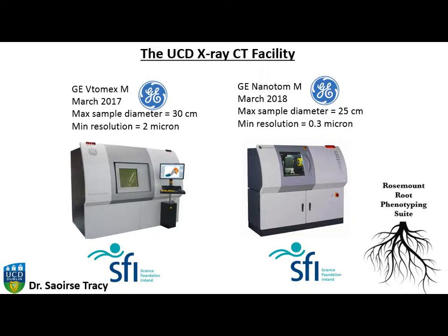But you can scan anything. You can scan chocolate bars, 3D printed titanium, plant leaves, anything you want to see inside of non-destructively. At UCD, I was lucky enough to get money to buy two CT scanners. The first one arrived in March 2017.